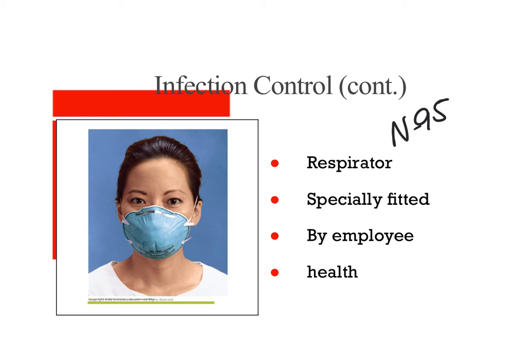It's specially fitted. You're given a number. Do not go into a room if you don't know your number, or if they don't have your number mask. This is making sure that nothing is getting through, and tuberculosis is not something you want to pick up from work.